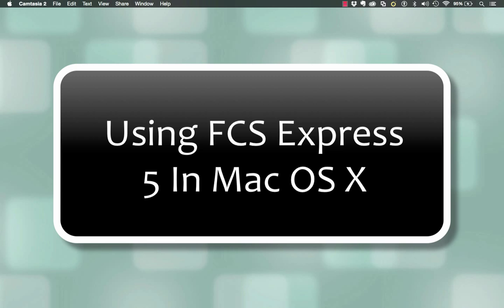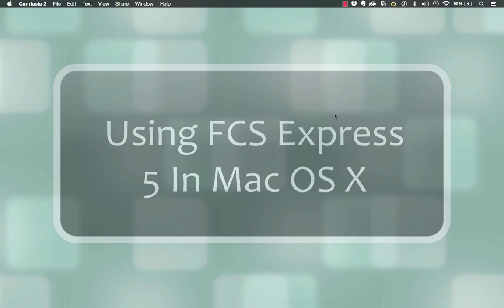We often get the question about whether or not FCS Express will run on a Mac system. While FCS Express is a native Windows application, it will run on Macintosh hardware through the use of virtualization software such as VMware Fusion, Parallels, and Boot Camp, just to name a few.